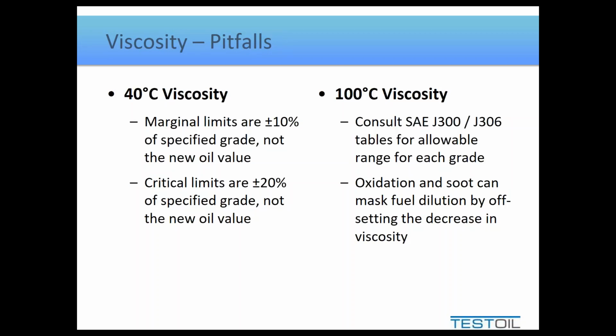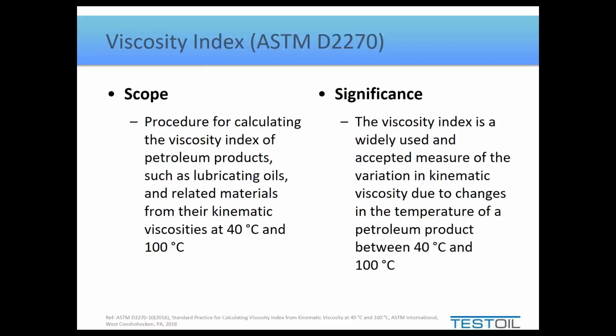Now, combined with viscosity, it is possible to also get viscosity index. Viscosity index is simply a number to represent how much an oil changes viscosity with temperature. So it's just a calculated index. It's a math calculation only. There is no test performed here.